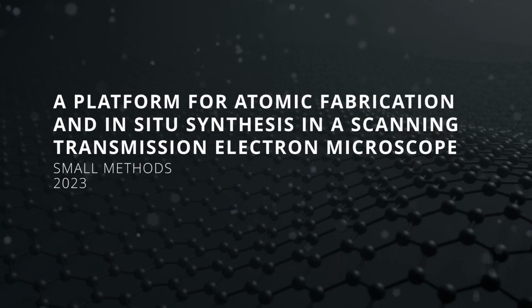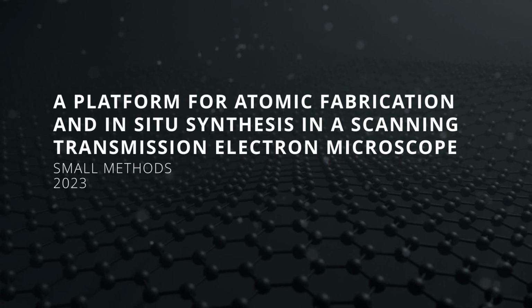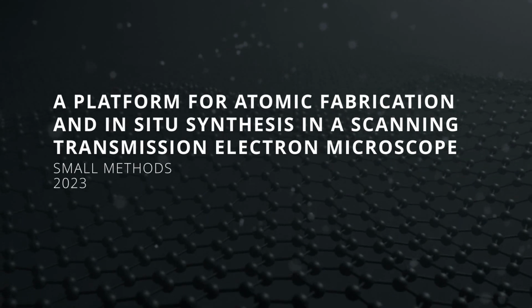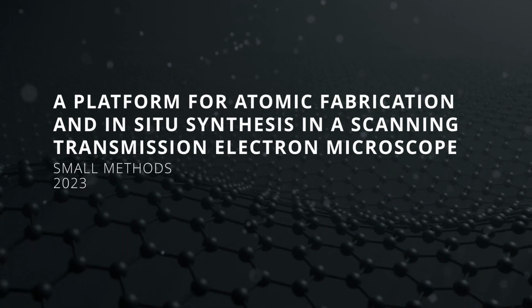A platform for atomic fabrication and in-situ synthesis in a scanning transmission electron microscope. This manuscript was published in the journal Small Methods in 2023.